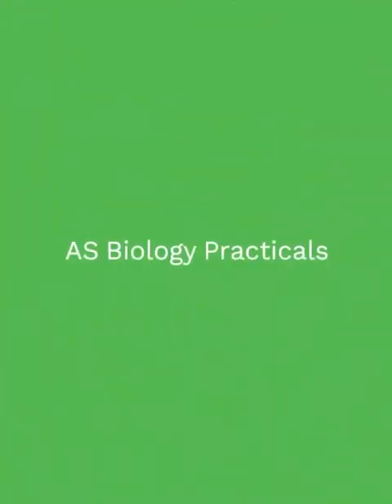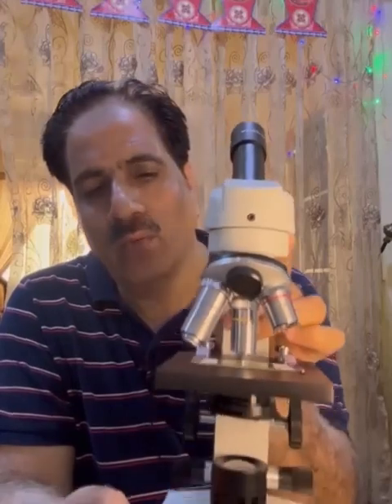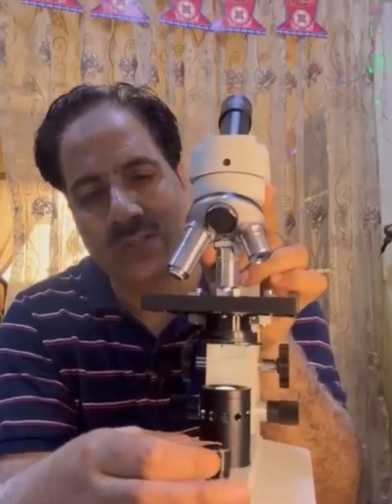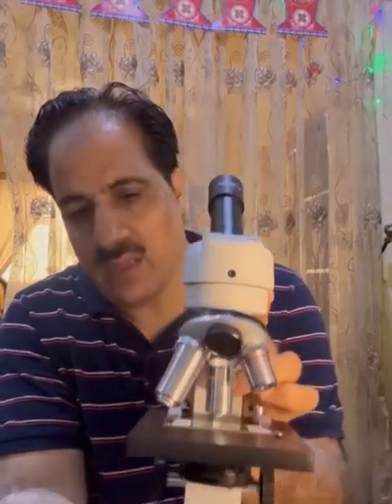I will show you how to use a microscope for AS biology practicals. This is a light microscope that I have in my hand, and first of all, we have to switch it on and off from here. So it's on. We can also change the light intensity from here as required by us.